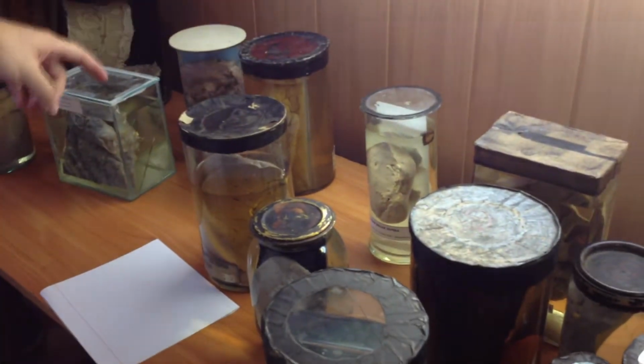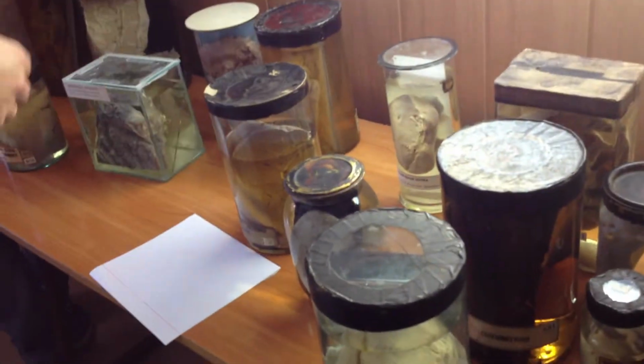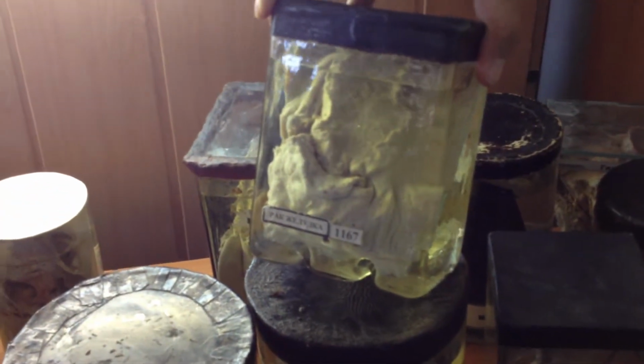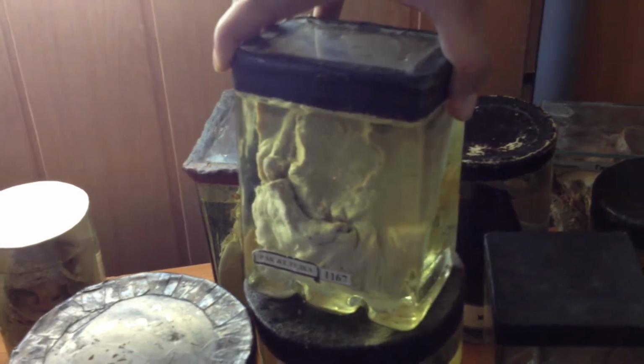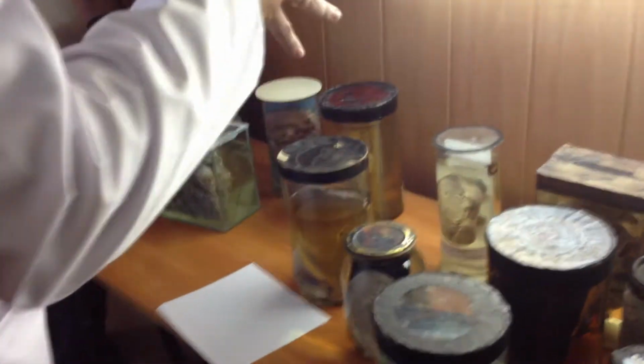Yes, if a patient survives such hemorrhagic infarction, their blood masses would be reabsorbed, and only the walls would be rust due to deposition of hemosiderin. But inside there would be a cavity filled with lucid fluid. This is the brain on the stage of organization. It's not fresh blood, so a few weeks maybe passed, but the cyst would be an outcome.